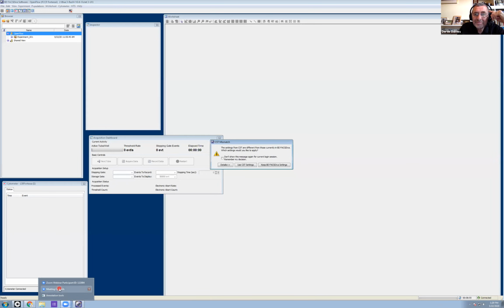No, so there's not a typical value. That's actually somewhat arbitrary, and we're not going to go into too many details with that today. Typically, if you have a bit of a higher Q value and a lower B, that typically winds up being a little bit better for resolution. But there's no defining number that we're going to say at this time would be recommended for you. Sorry, go ahead. I was going to say that the QR is going to be dependent on the particular machine, because it's a function of the optical filters in there and the actual PMT itself.